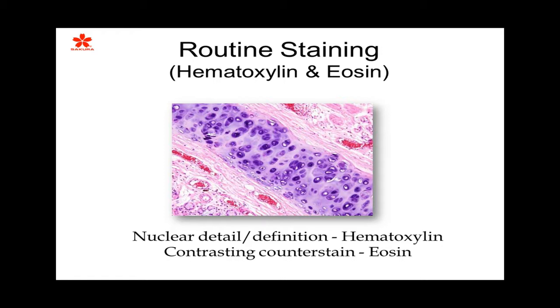Because they're early cartilage cells, they're very rich in DNA material, and that's why they're picking up so much hematoxylin staining. And then you also see a slight contrast around that with the contrasting stain to the cytoplasm and connective tissue. The light blush stroma, tissue stroma that is bordering those chondrocytes, or that early chondrocytic strip.